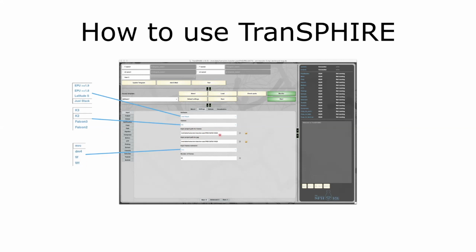But this is not necessarily the case, unfortunately. But if you collected a data set yourself, you might know that if you specify something in EPU as an output directory, this is where the JPEGs are stored, and the frames are stored in a different directory, which is in the main directory. So you need to specify different paths in this case.